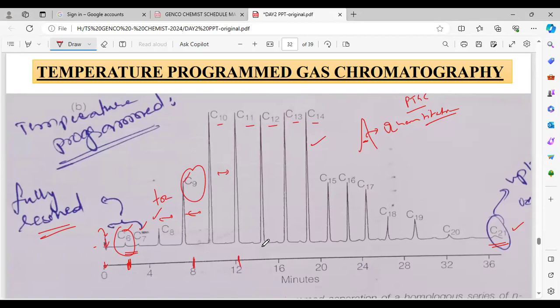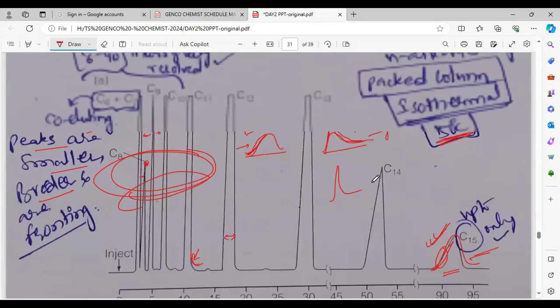ఇస్ ఇట్ క్లియర్? క్వాంటిటేటివ్ ఇన్ఫర్మేషన్ ఏం చెప్తుంది? పీక్ హైట్, దాని విడ్త్, మీకు శాంపిల్ కాన్సన్ట్రేషన్ ఉంటుంది. అంటే ఇది ఒక 5 గ్రామ్స్ ఉంది అనుకోండి, ఇది 10 గ్రామ్స్ ఉండొచ్చు. జస్ట్ ఫర్ ఎగ్జాంపుల్ తీసుకుంటున్నా, కానీ ఆ తీసుకున్న శాంపిల్ ఇంజెక్షన్ అవుతుంది. ఇంజెక్షన్ ఎంత ఉంటుంది? 5 ml ఉంటుంది జనరల్గా. కానీ జీసీ ఇంజెక్షన్స్ ఎలా ఉంటాయంటే మైక్రో లీటర్స్లో ఉంటాయి, చాలా చాలా తక్కువ. అందులో ఆ తీసుకున్న శాంపిల్స్ లో కాన్సన్ట్రేషన్ వీటిది ఎక్కువ ఉండొచ్చు పర్హాప్స్. సో వాట్ ఈస్ ద డిఫరెన్స్ బిట్వీన్ దీస్ టూ పీక్స్?